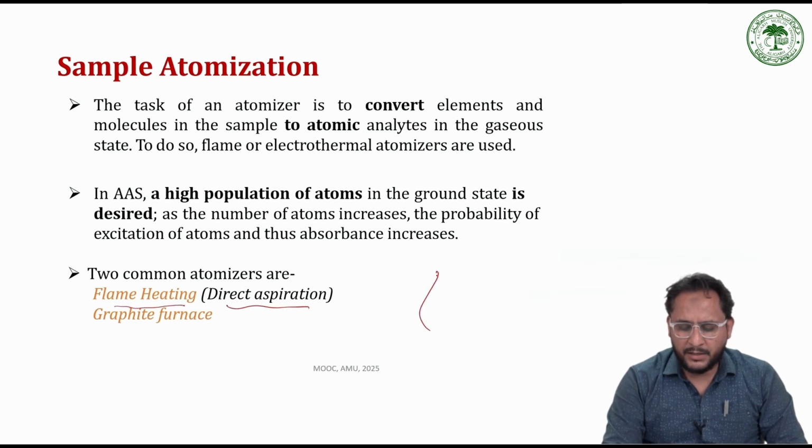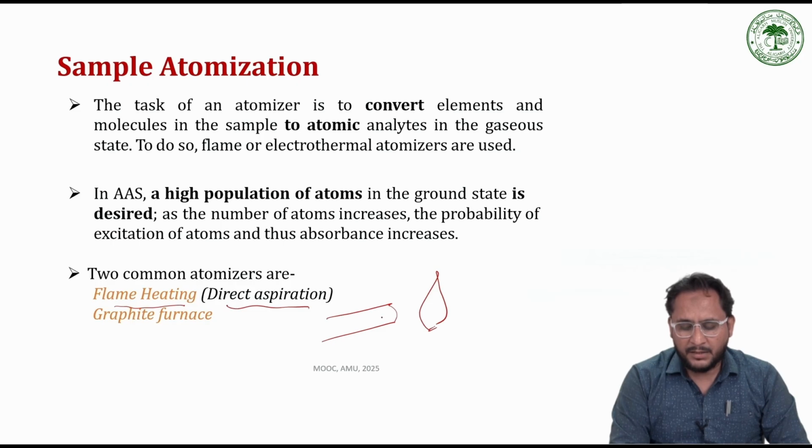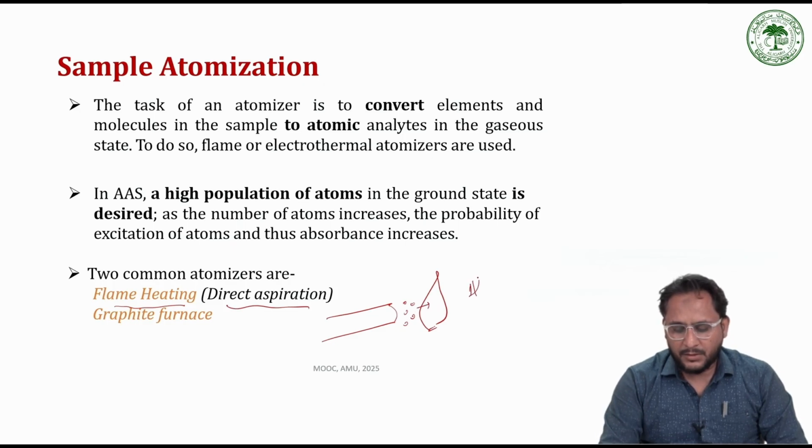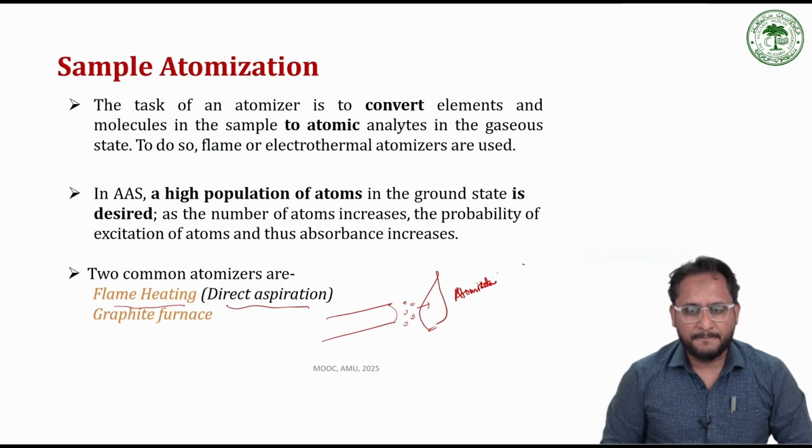we directly light a flame, and the aerosol that is coming from the nebulizer directly enters and undergoes atomization, meaning desolvation, vaporization and dissociation.